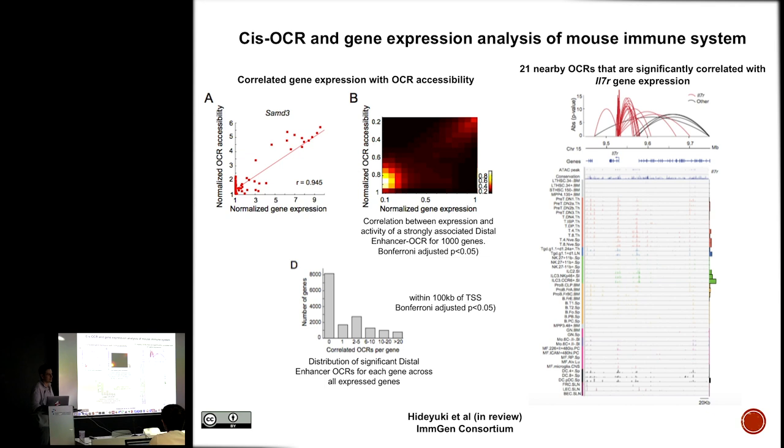Hierarchy. Correct. So that's what makes this kind of analysis nice, is that you can go to the meta cell, right? So a meta cell being that you describe all T cell accessibility or all B cell accessibility as one. But then within that block, you can look at the resolution of how those dynamics are changing. So there seems to be some higher order structure that follows quite nicely.